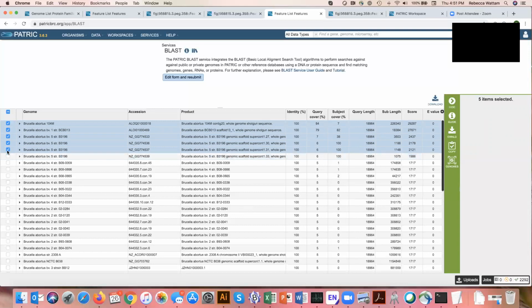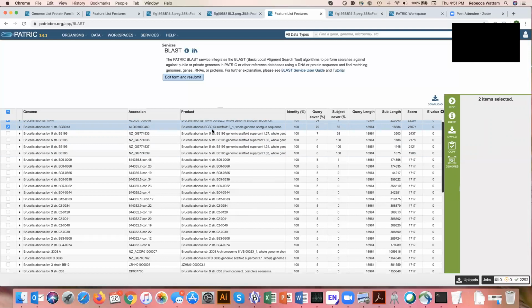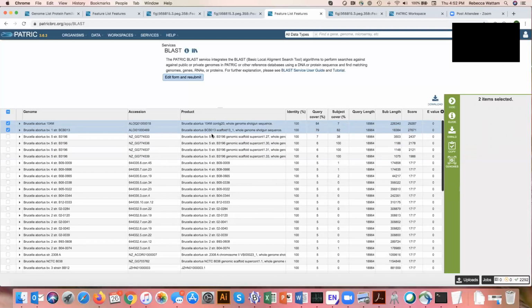And you know, to be honest, this isn't so great either. So I would argue that out of all the Brucella abortus, these two are the ones that have the best hit to this, and that everybody else just has tiny little pieces. These guys have got most of it.